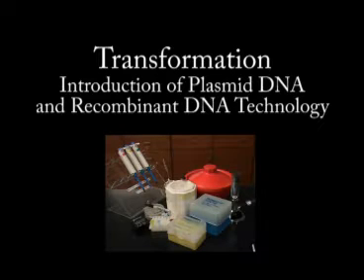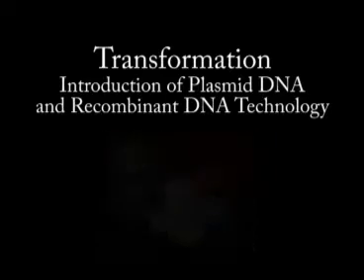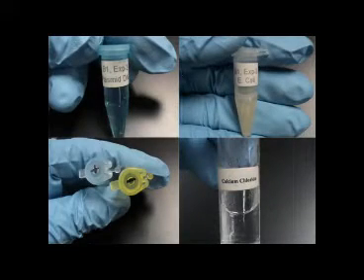Transformation. Introduction of plasmid DNA and recombinant DNA technology. For the transformation experiment, you will need plasmid DNA, which is pUC18, E. coli, microcentrifuge tubes labeled positive and negative, and cold calcium chloride. The positive tube will contain your pUC18 plasmid. The negative tube will contain water as a control. Calcium chloride will be used to make E. coli cells competent for DNA uptake.